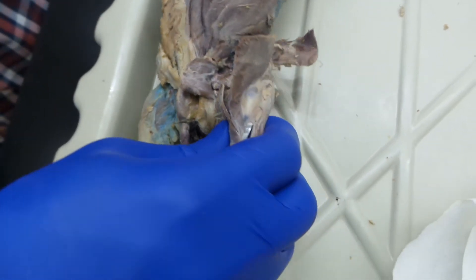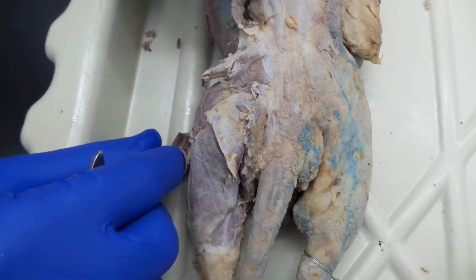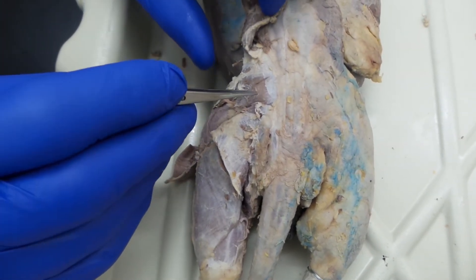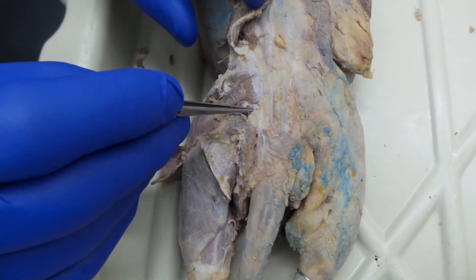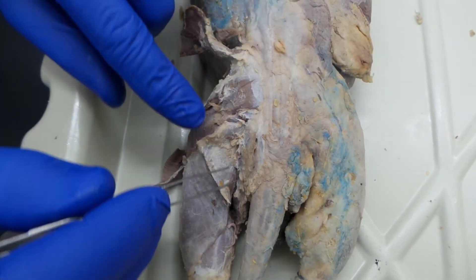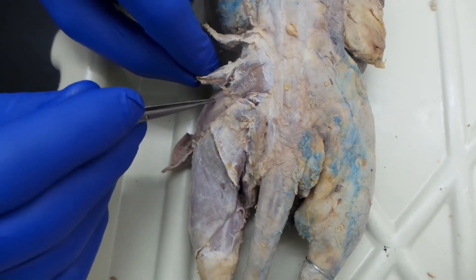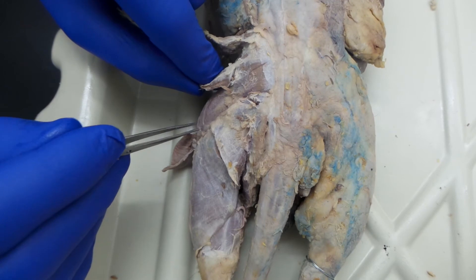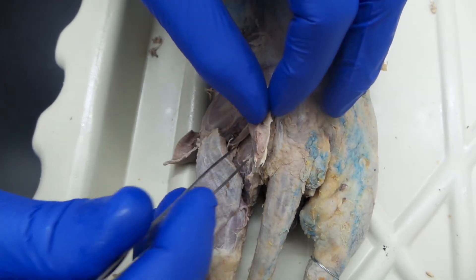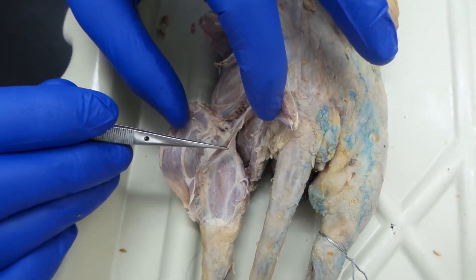Now we're going to work around to the other side. We're still looking at that sartorius here. Here's that tensor fasciolati. And then we have gluteus maximus, gluteus medius, and this little muscle right here — that's the caudofemoralis. This huge muscle right here is the biceps femoris, again the tensor fasciolati, and that's all vastus lateralis. Once you get those identified, you cut through that biceps femoris, and running along the medial side is this little mink-only muscle called the tenuissimus.